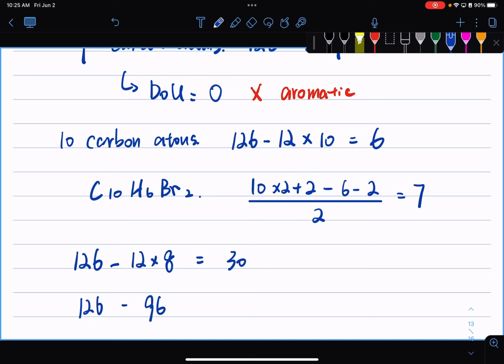There's no molecule that can have only 8 carbons and 30 hydrogens. So it's just not correct. There's a limit to what we can do, but this is one of the fast and easy ways to find out. Just take a guess at what it looks like. Yeah. Why did you do 286 instead of 288? You can do 288, but then for 288, you need to minus 81 and then minus 81. It's the same.